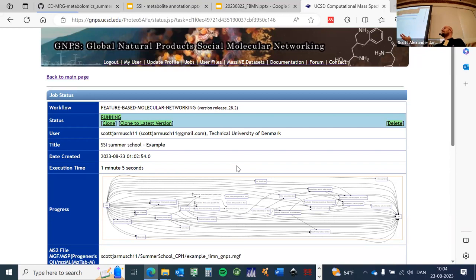So they're either just superfluous files. For instance, you can access spectral libraries through some of those folders. Or in my inputs, I had actually pulled up some massive data sets. If you have a massive data set you want to pull data from, you can say, pull that file, and then I can open it up and click individual files in that massive data set. So there's another way to grab files.